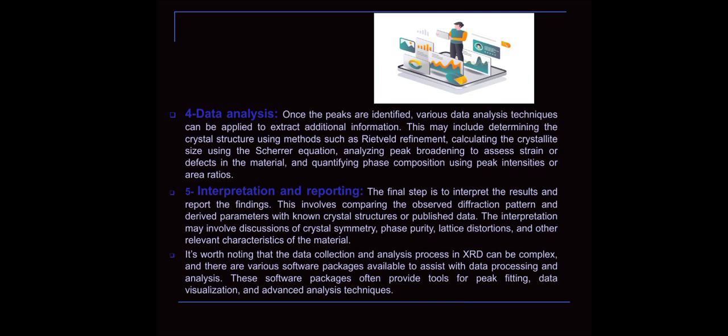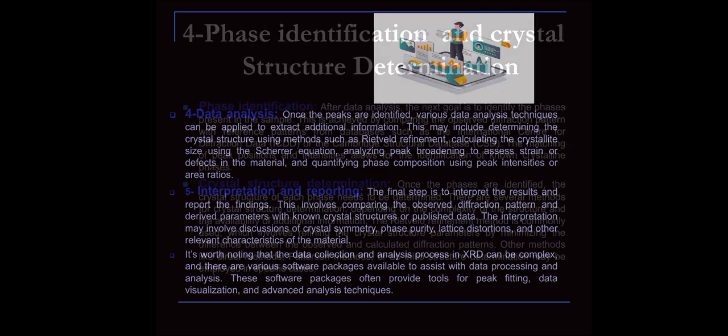It's worth noting that the data collection and analysis process in XRD can be complex, and there are various software packages available to assist with data processing and analysis. These software packages can often provide tools for peak fitting, data visualization, and advanced analysis techniques.